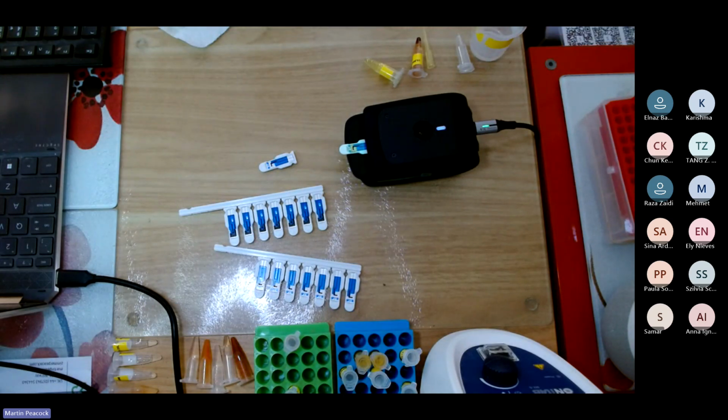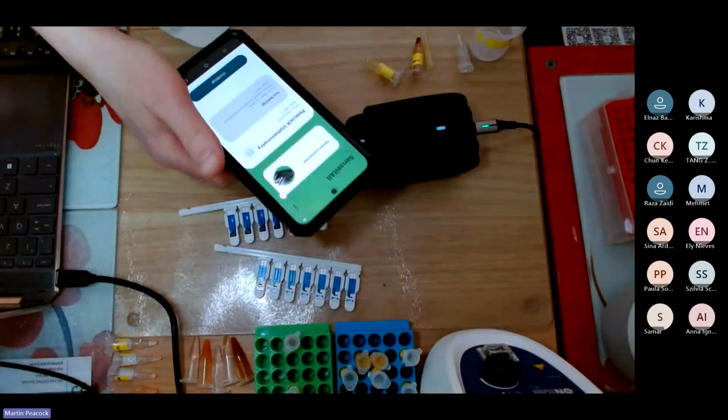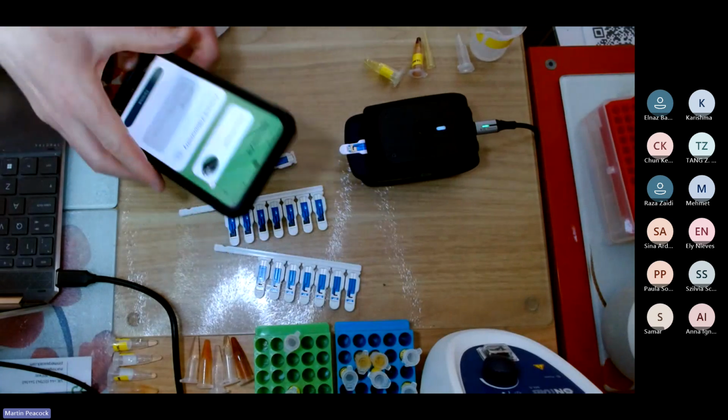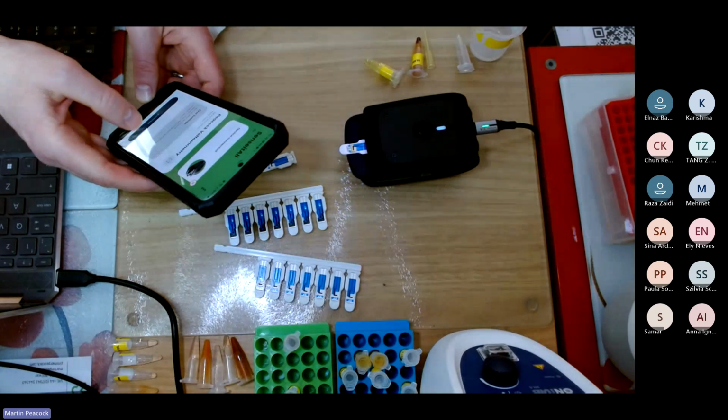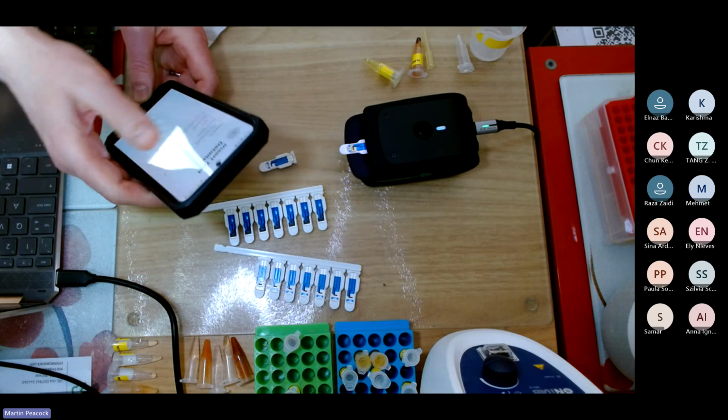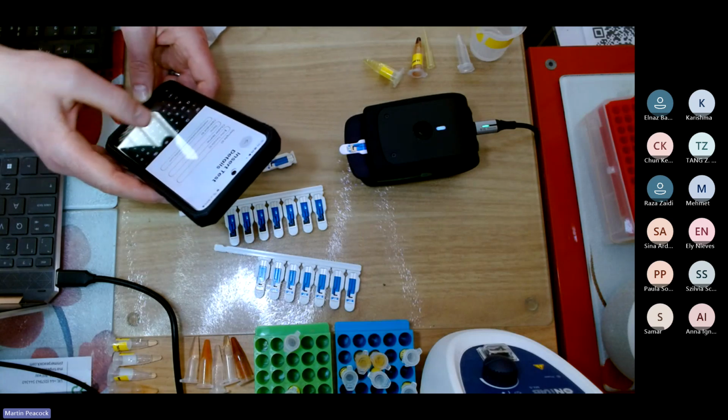I'm going to show you the last QR code of the day, which I will scan. So I've scanned that QR code. I've put myself into a particular modality. I'm going to reuse that screen-printed electrode. I didn't need to necessarily throw it out this time. I'm going to give this a name so we can find the data.